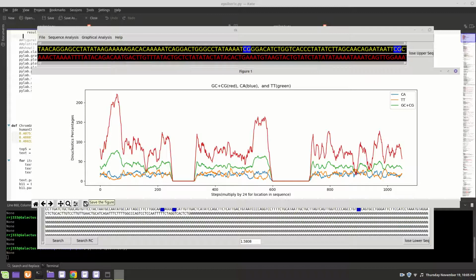All right, now what we're looking for is a place where the green line is peaking like this, and the blue and the orange are peaking together at a low point. So we want when this is highest and these are lowest. And if you go through this, this doesn't happen very often, but it does happen right here, where these are dropping at the bottom pretty much at the same time this is at the top.